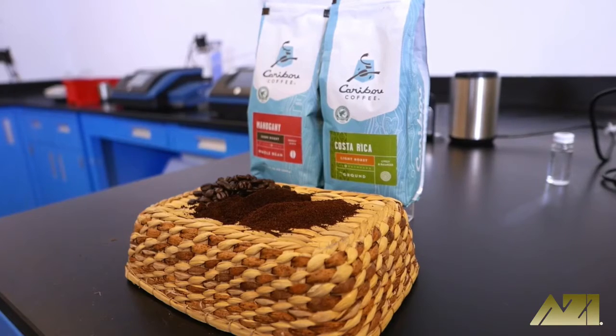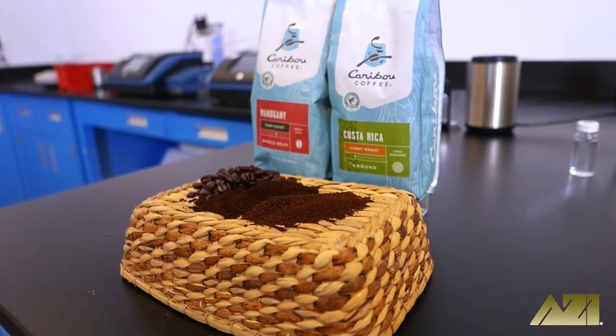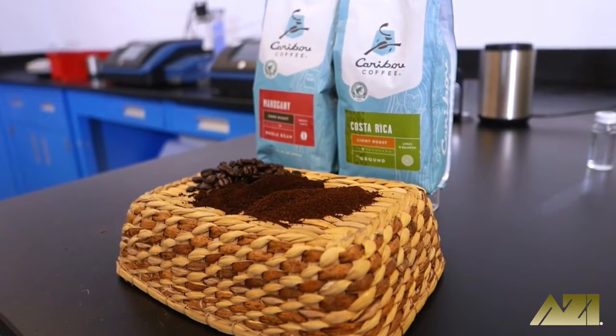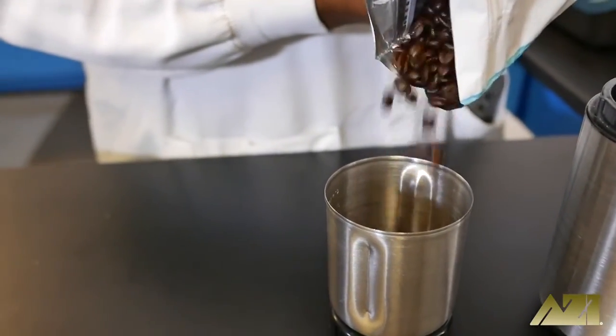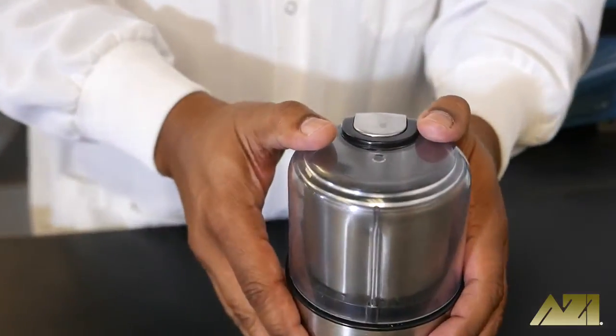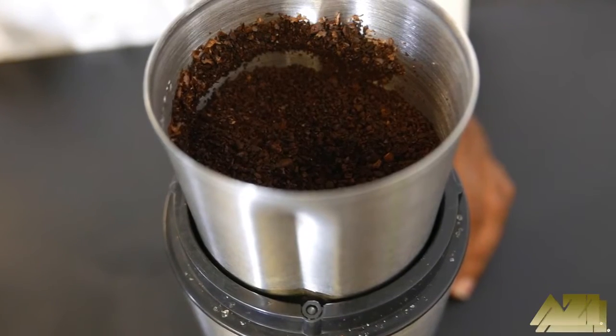For today's test, we're using store-bought light and dark roast coffee of the same brand. One was ground and one was whole bean. The whole bean variety was ground before testing to increase the surface area of the sample. This allows any moisture to be driven off more quickly and efficiently as the sample is heated.